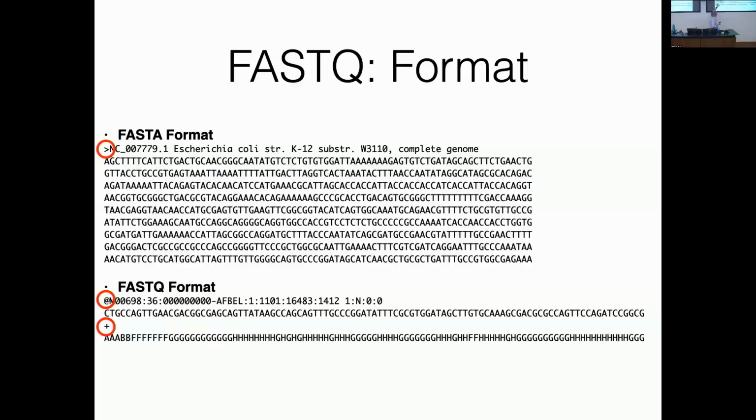So this is like one sequencing read. If you remember from last week, we talked about sequencing reads. So this is one sequencing read, and you're seeing the whole sequencing read. You'll notice that the line is longer than the FASTA file. The FASTQ file actually allows for the sequence to be wrapped on another line, right? So we could take this and chop it here and put the rest there. You almost never see that, but it is allowed.